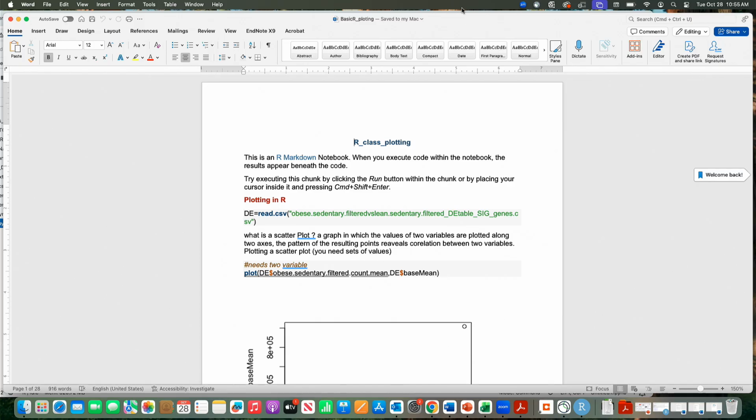I don't know. Do you want me to extract? Yeah. I just did drag and drop there. Maybe download it and then, yeah. Okay, everybody has the files in their Jupyter notebook? Okay, extra 30 seconds. This is what Francis gave you.